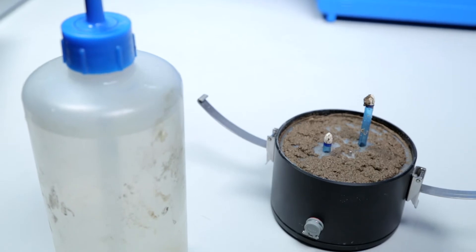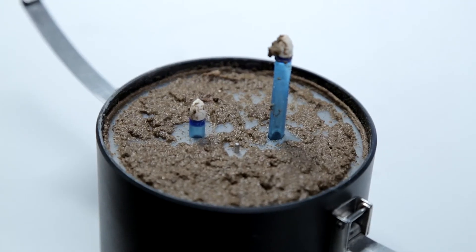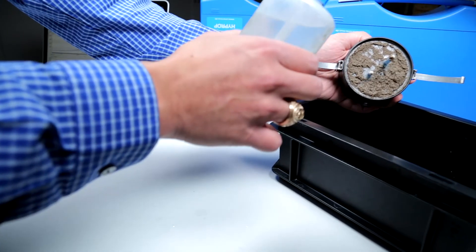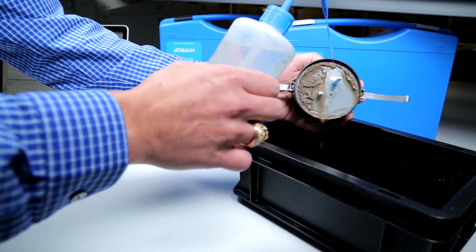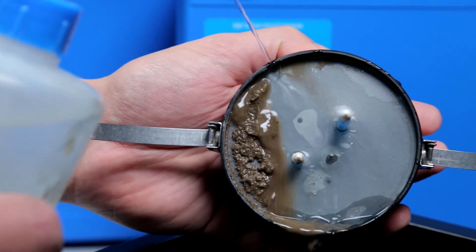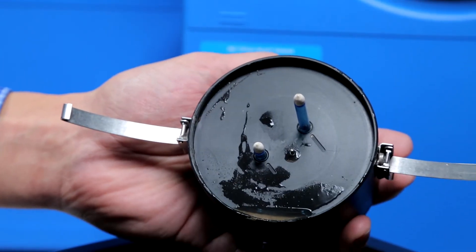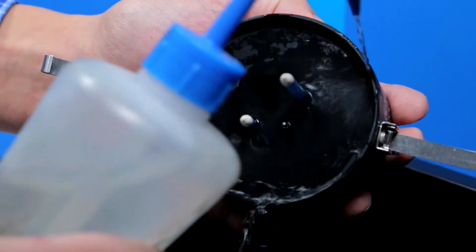When you have finished running a HI-PROP campaign, it is very important to clean the HI-PROP base before removing the tensiometer shafts. If the shafts are removed before the base is cleaned, soil particles can enter the pressure sensor over time, causing the readings to drift and causing the sensor to become more brittle over time. These tips for proper care of your HI-PROP will help ensure the longevity of your instrument.